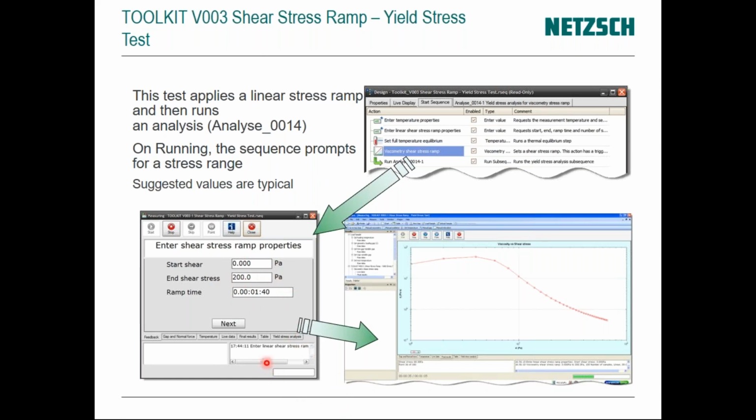A good rule of thumb here is the yield stress of ranch salad dressing is about 10 pascals, and toothpaste is about 200 pascals. So if you think, is it thicker than ranch, is it thicker than toothpaste, you can get an idea. You only have to be in the right order of magnitude here.